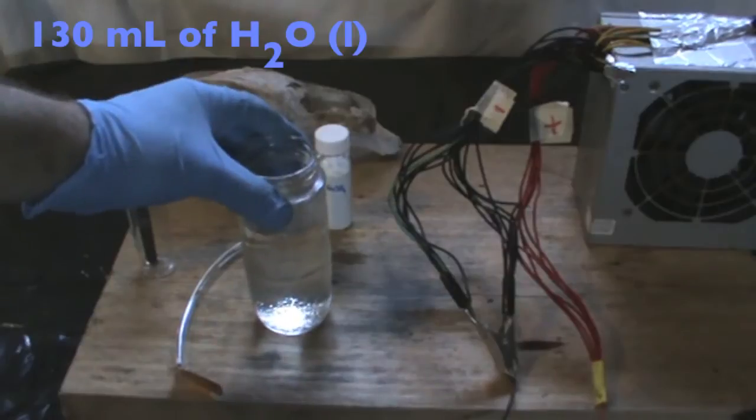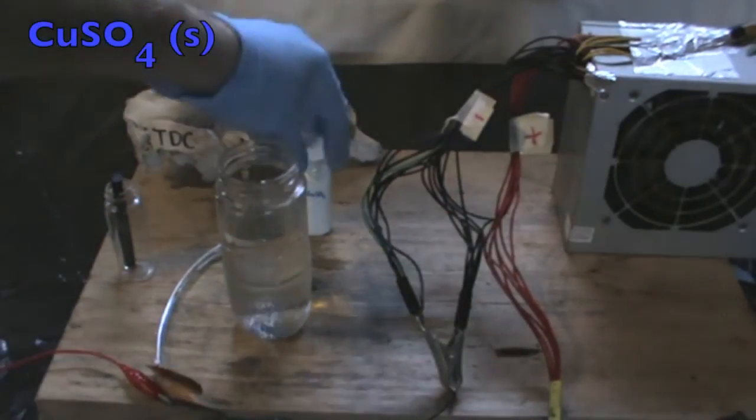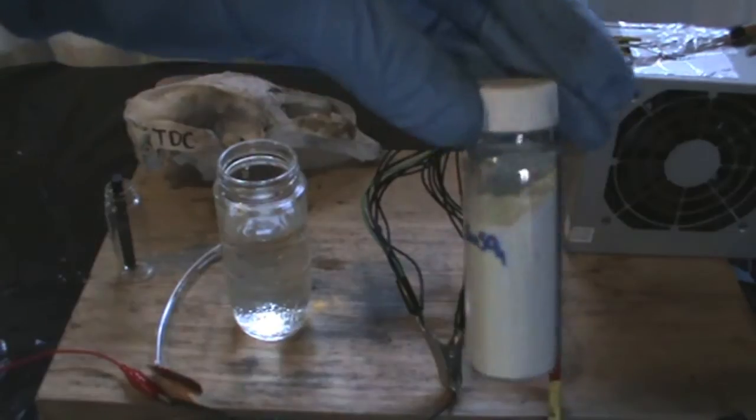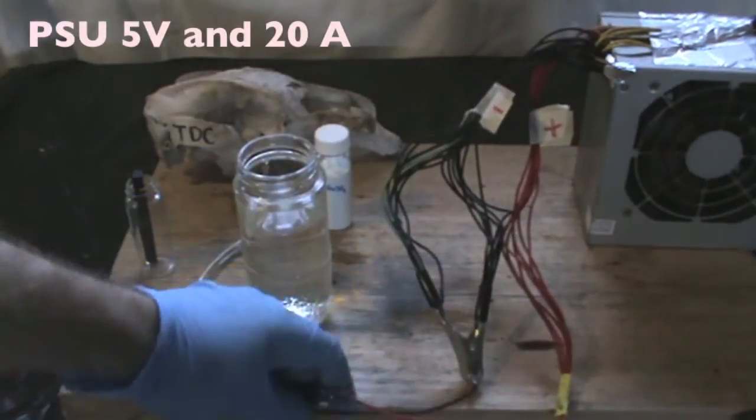Pour water into a suitable container. Then get some copper sulfate and finally a power source that delivers 5 volts and 20 amps.